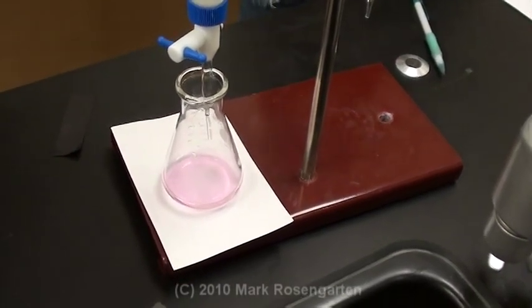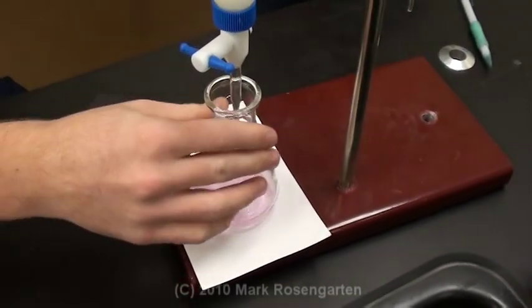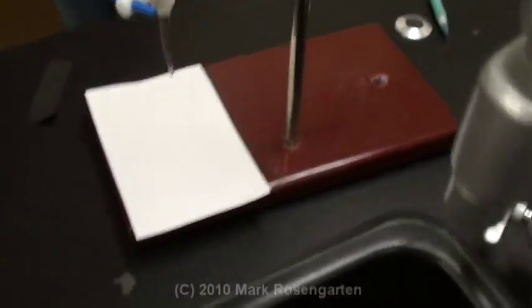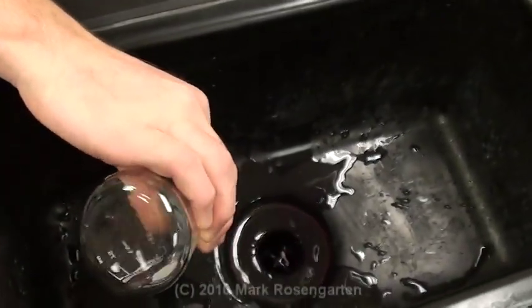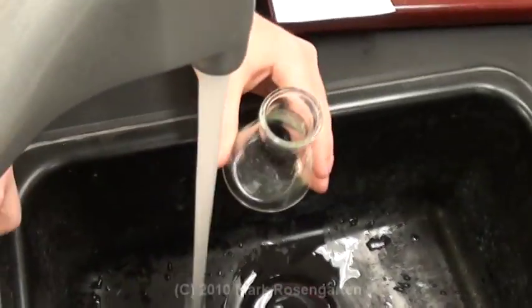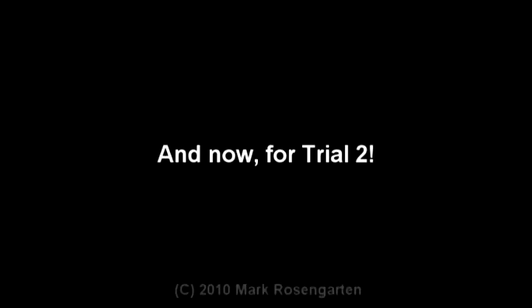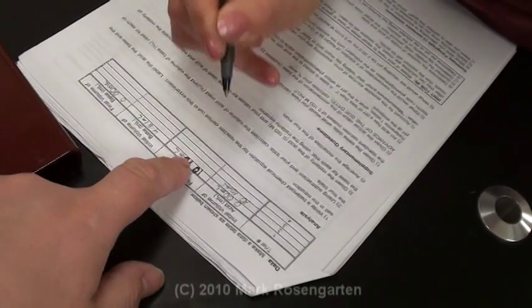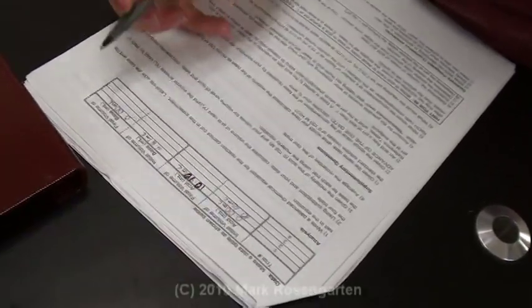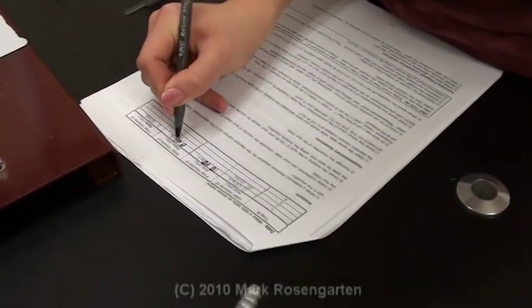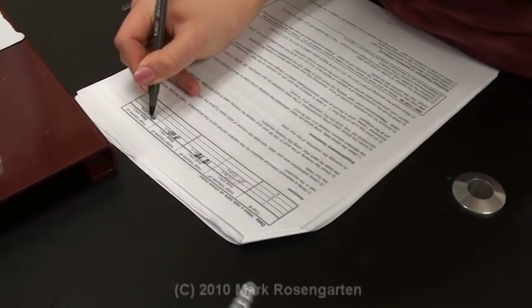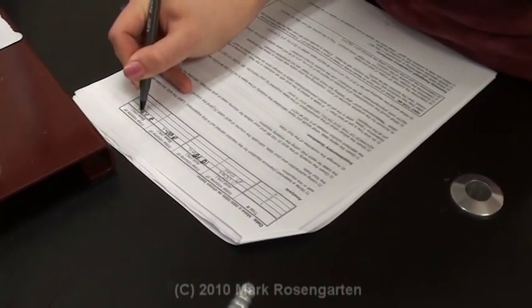Now that you've finished your first trial, you can take the flask, dump it in the sink, and give it a good rinsing. Your final volume of trial one becomes the initial volume of trial two. And then you will repeat the process, putting in another fresh 10 milliliters of acid into the flask.